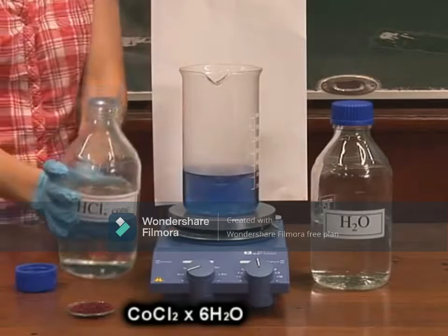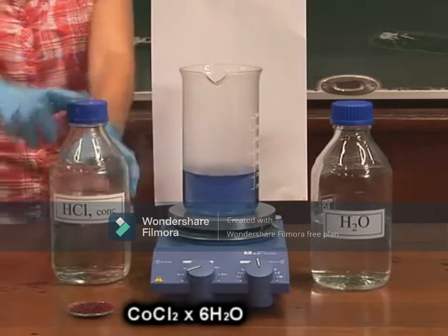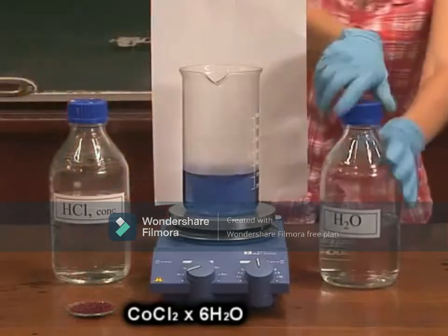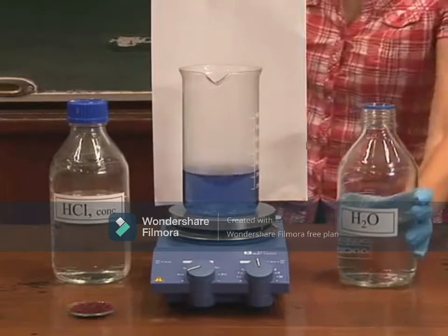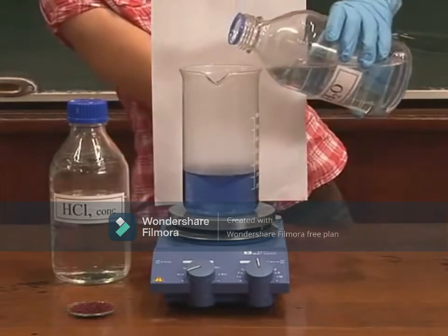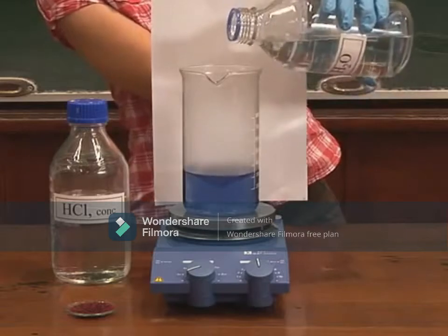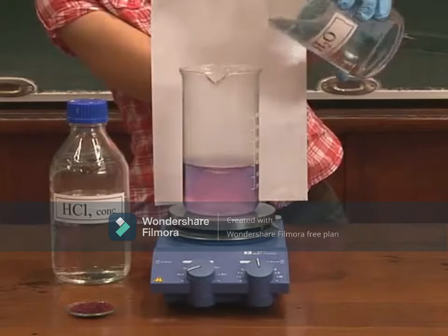This is due to a chemical equilibrium shift. However, if we add more water to the blue solution, there will be a change in the color as well. So it will reverse back to the original pink color.